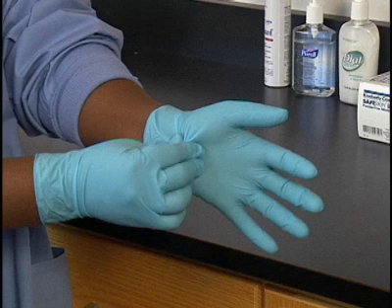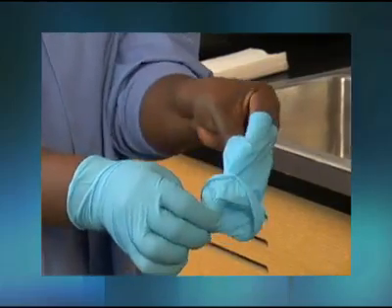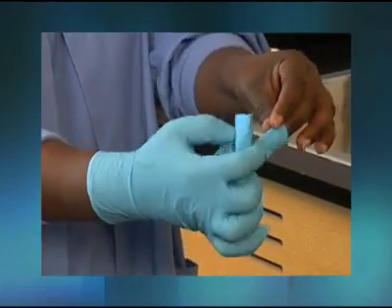Grasp the outside of one glove about 1 to 2 inches from the top with your other gloved hand. Most people use their right hand to remove their left glove first. But you may start with either glove if there are no visible contaminants on your gloves. However, if one of your gloves has blood or infectious materials on it, you should remove that glove first.